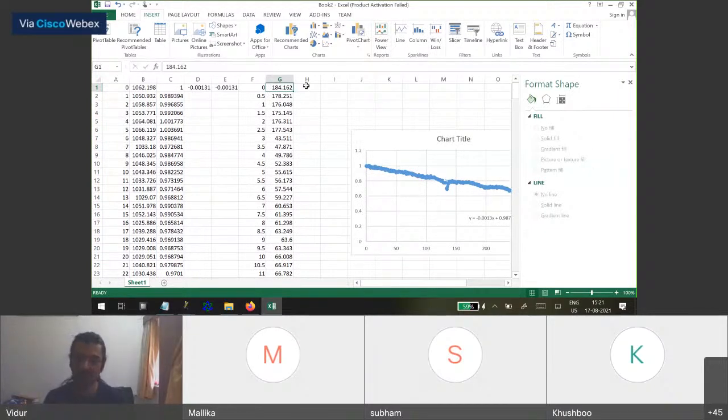The first thing that we have to do is to normalize it like we did previously. Normalization here is a little more detailed, because the first thing you do is average out all the pre-bleach numbers, because we have to be sure of where our pre-bleach intensity actually was. So for this, we just put equal to and we put average, and you average the first 6, in this case, pre-bleach columns.